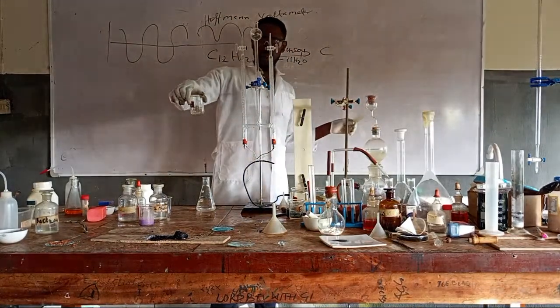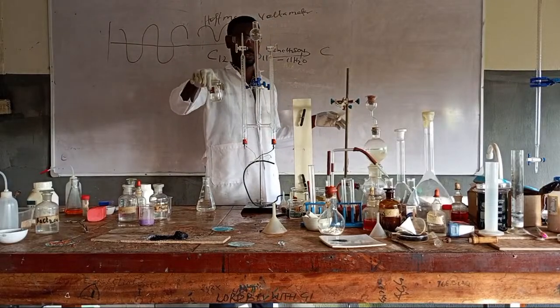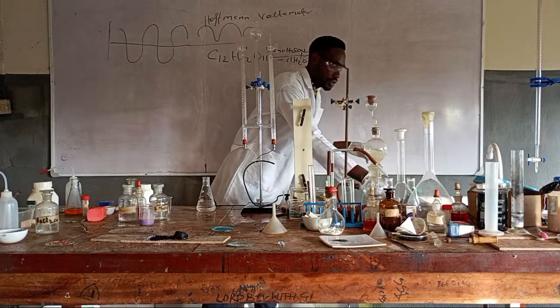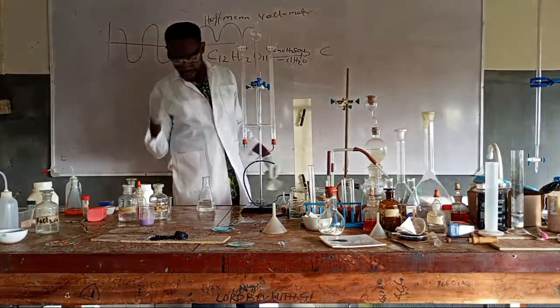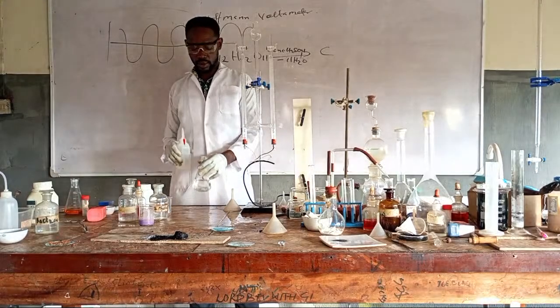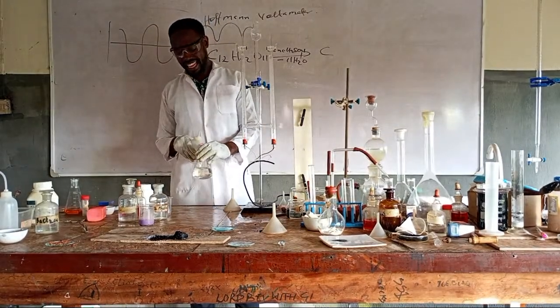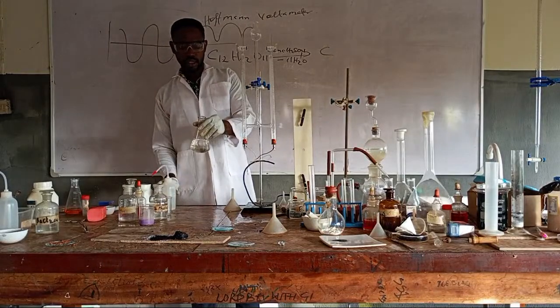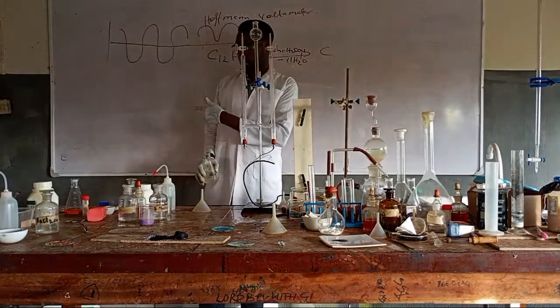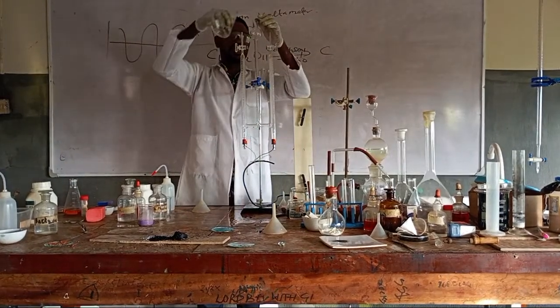Remember, this is water. You don't add water to acid. If you add water to this thing, you forget where. You were taught not to add water to acid, rather add acid to water. Am I communicating? I will add it, but I didn't bring out the protective glass we use for that experiment.